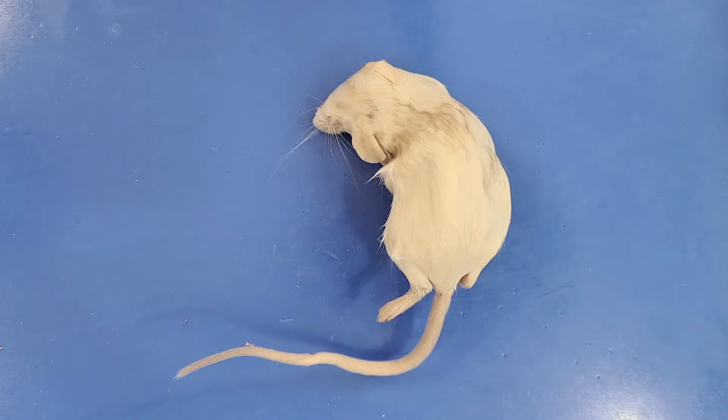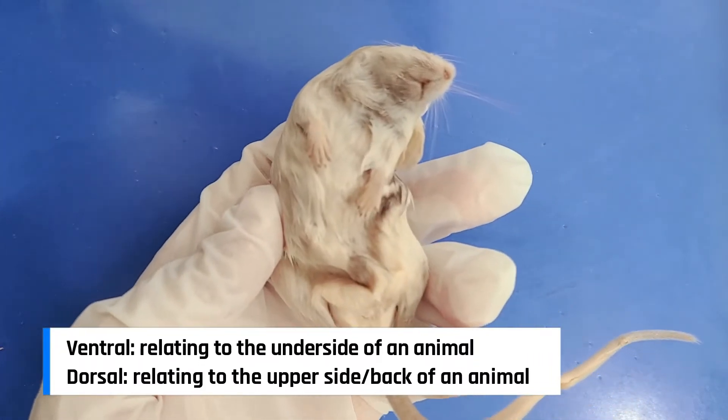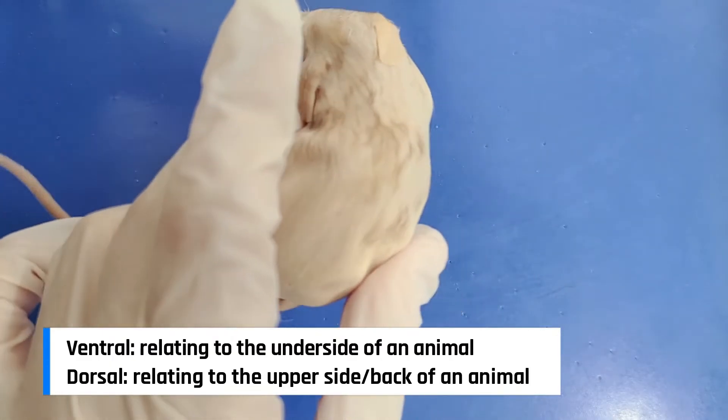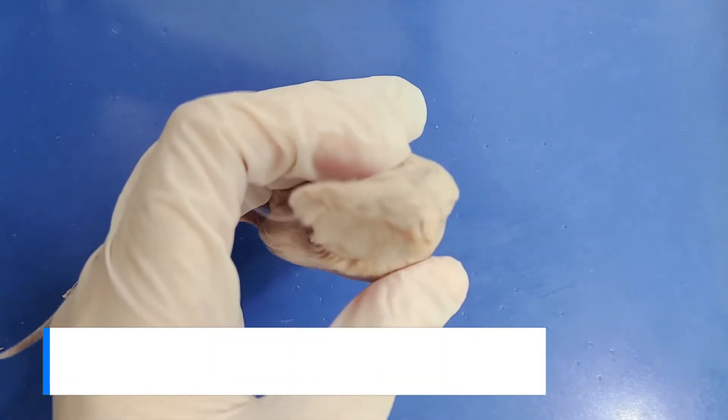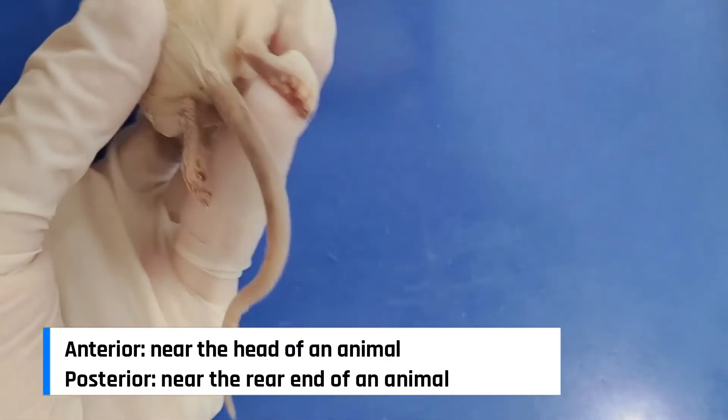First, let's take a look at the external anatomy. Here is the ventral side, here's the dorsal side, here's the anterior side, and here is the posterior side.